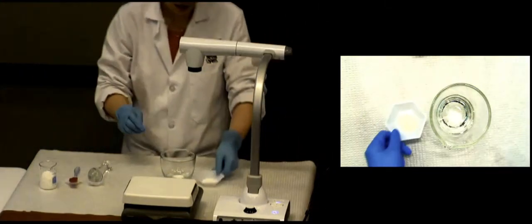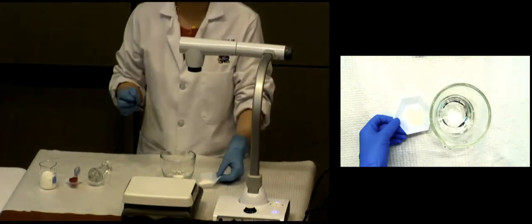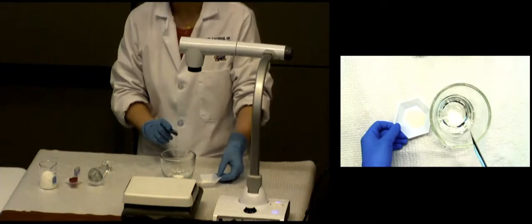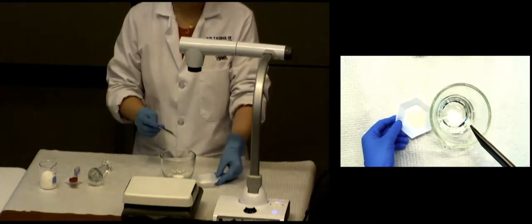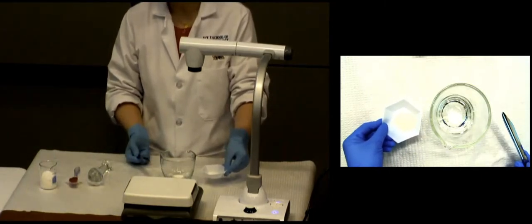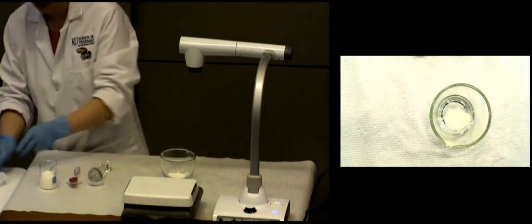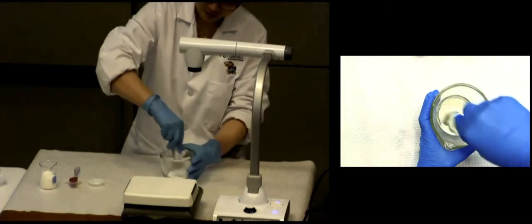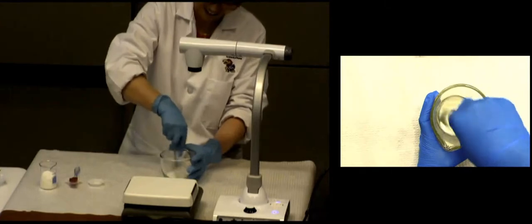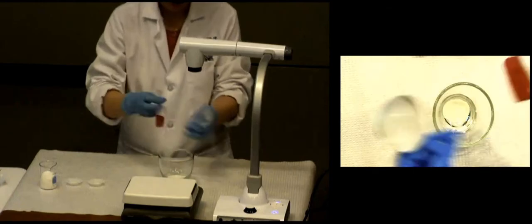Okay, based upon the estimation of how much powder I have there already versus how much indomethacin I have, way more indomethacin than ondansetron. So what do I need to do now? Another term: I need to do geometric dilution now. So I probably need to do about twice minimally. Okay, 5 minutes later, I did my first dilution and the second one. Well, in the exam, you cannot just say 5 minutes later, okay?